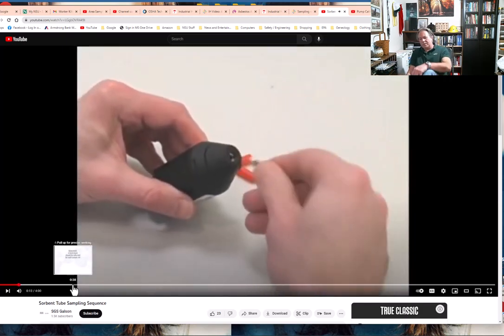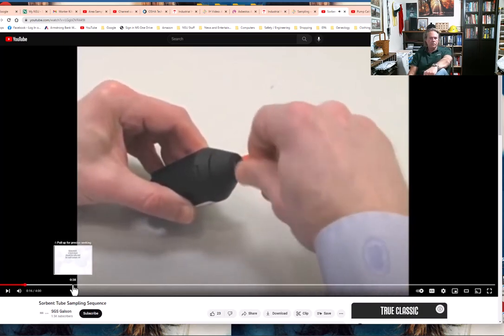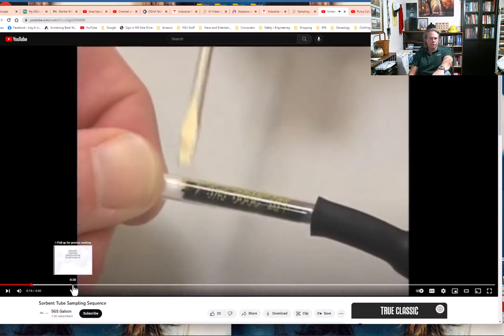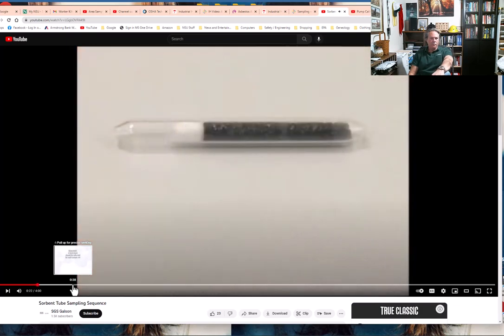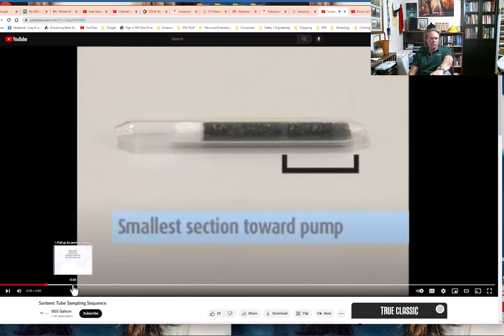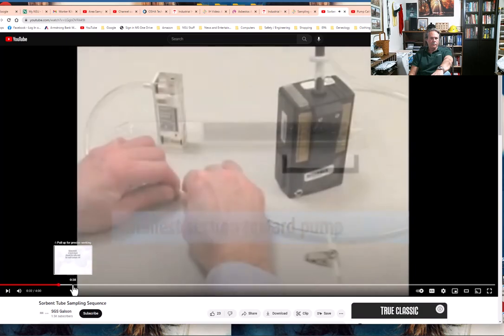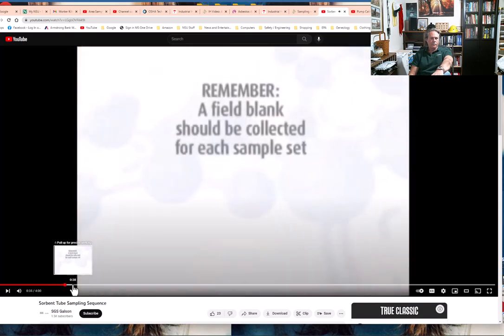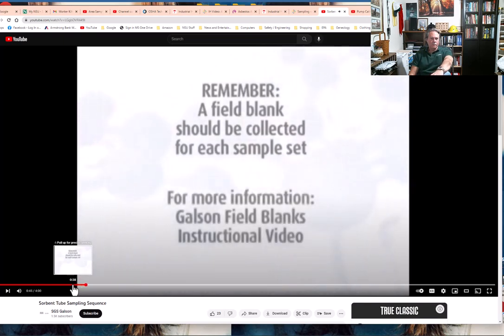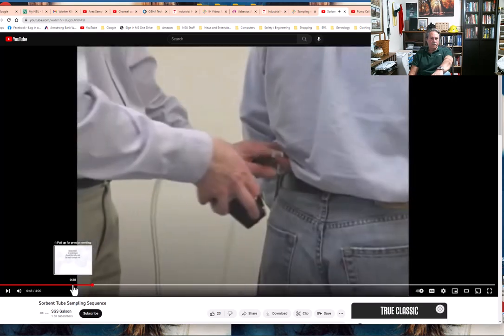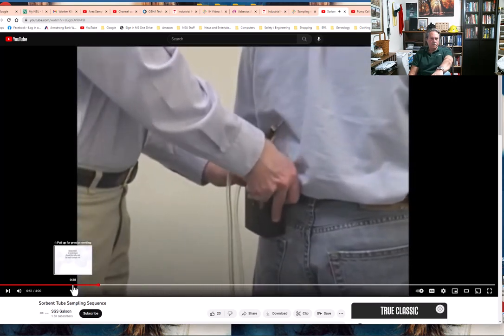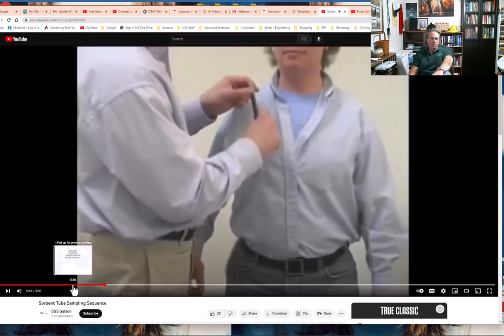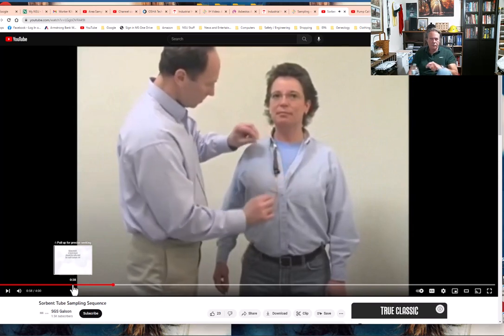Use a tube breaker to break both ends of the sorbent tube to provide an opening at least one half the internal diameter. Insert the open sorbent tube into the adjustable low flow holder's rubber sleeve with the arrow on the tube pointed toward the holder. If the tube does not have an arrow, place the end with the smallest sorbent backup section into the tube holder toward the pump. Attach the pump to the worker's belt toward their side or back, and attach the sorbent tube near the front of the shirt collar, as close as practical to the nose and mouth.